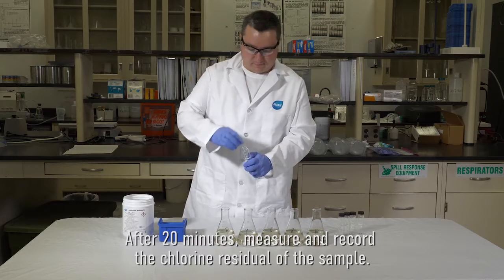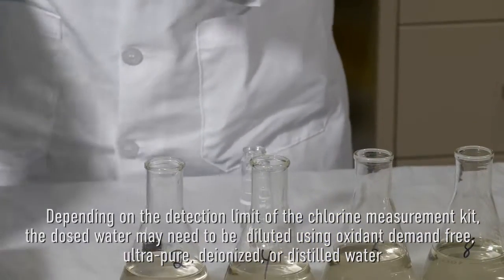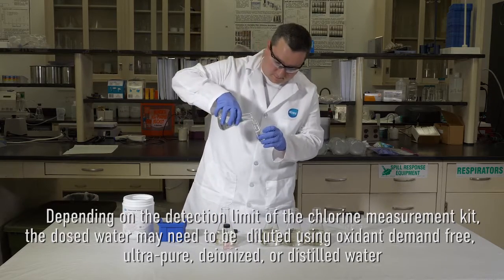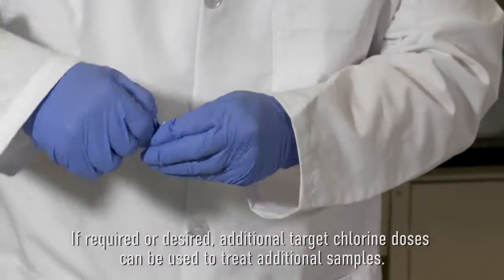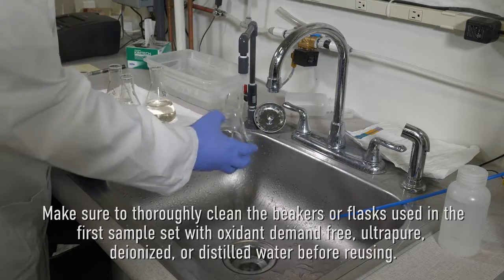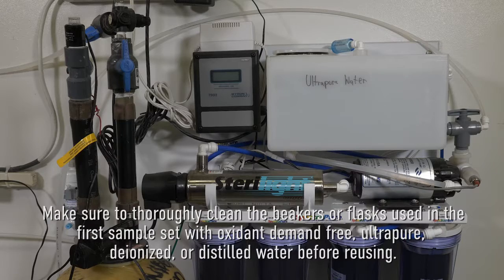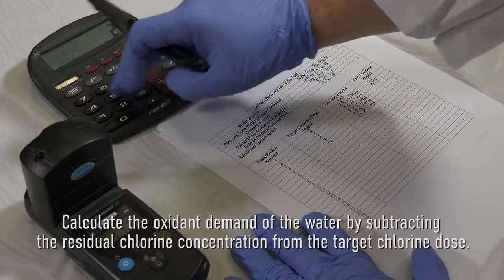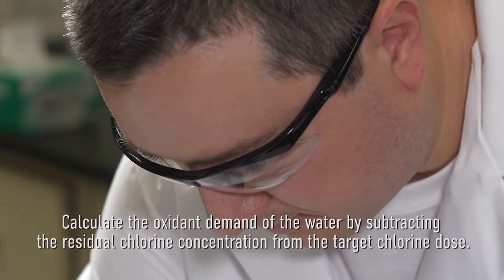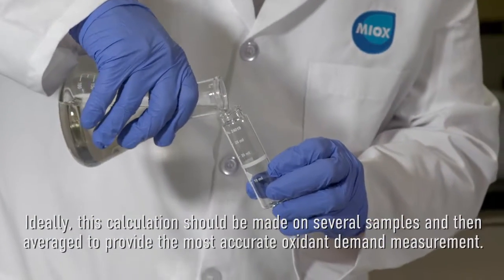After 20 minutes, measure and record the chlorine residual of the sample. Depending on the detection limit of the chlorine measurement kit, the dosed water may need to be diluted using oxidant demand-free, ultra-pure, deionized, or distilled water. If required or desired, additional target chlorine doses can be used to treat additional samples. Make sure to thoroughly clean the beakers or flasks used in the first sample set with oxidant demand-free, ultra-pure, deionized, or distilled water before reusing. Calculate the oxidant demand of the water by subtracting the residual chlorine concentration from the target chlorine dose. Ideally, this calculation should be made on several samples and then averaged to provide the most accurate oxidant demand measurement.